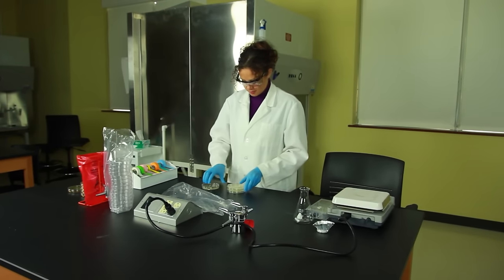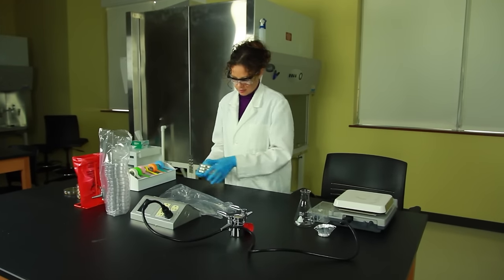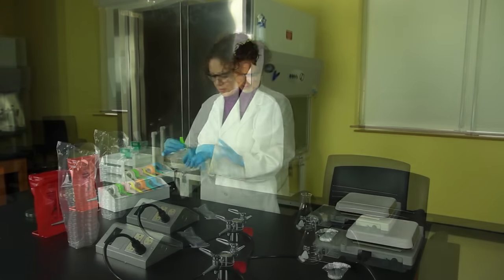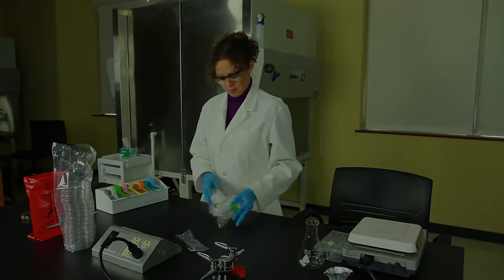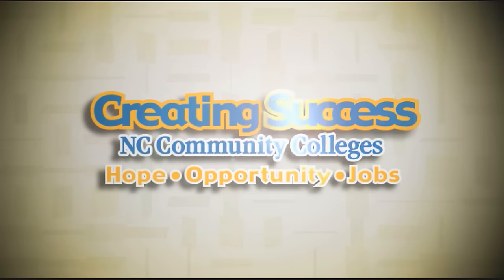Turn the plates upside down to prevent moisture from condensing on the agar surface and store them in a plastic bag until you're ready to use them.